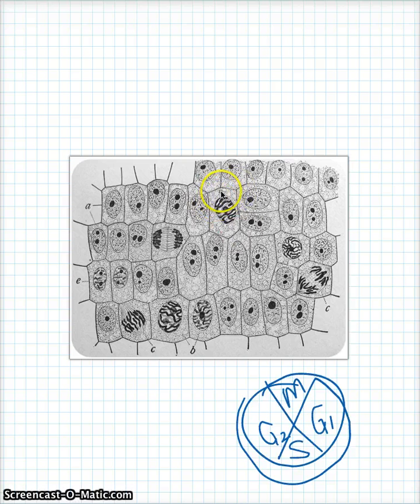All right, this guy right here, prophase. We can tell it's prophase because we can still sort of see the nuclear membrane, and we can still see the little nucleolus, but the chromosomes are starting to show up.